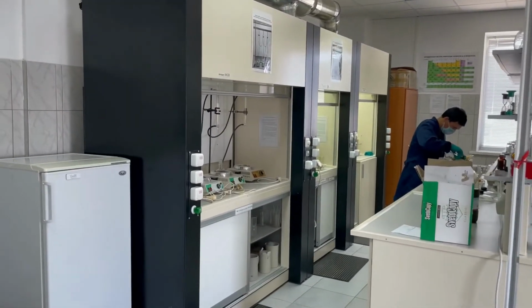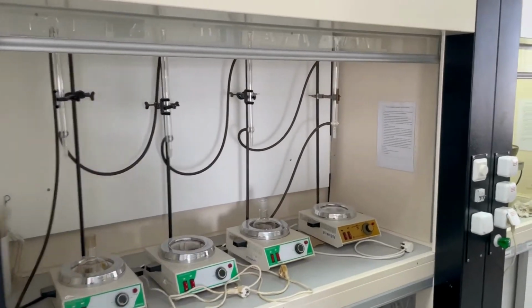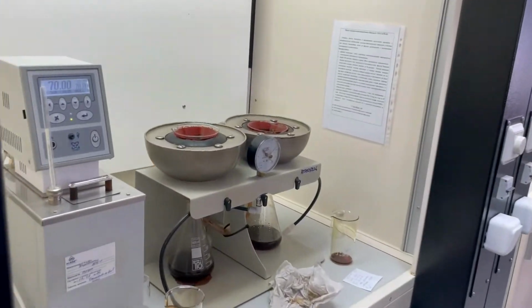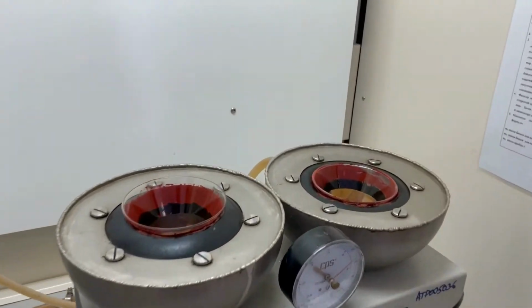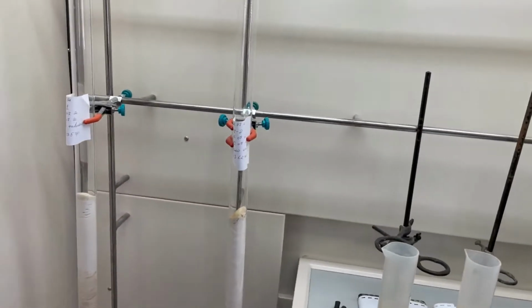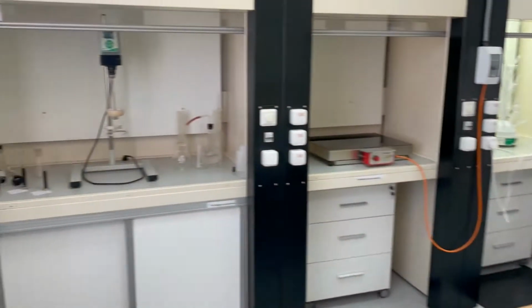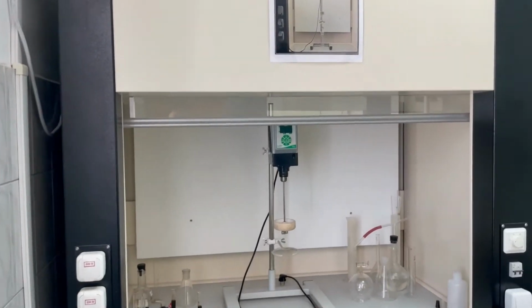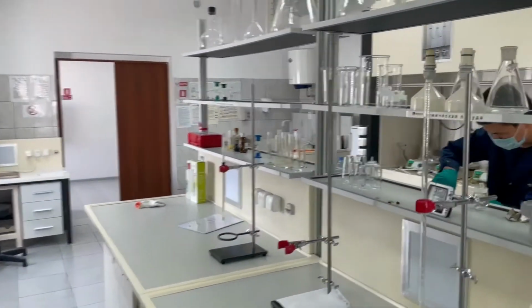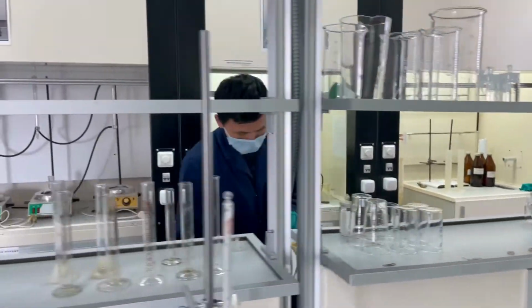Also we've got another oil laboratory. Here we analyze the water content in the oil. So here we analyze the mechanical impurities and columns for the asphaltenes, resins and paraffins and the analyzing of chloric salts. Here are our young specialists.